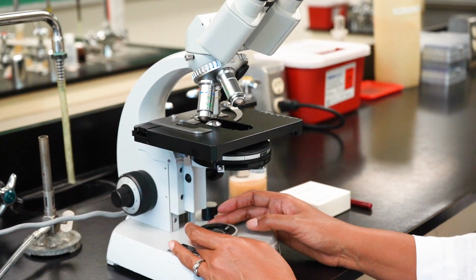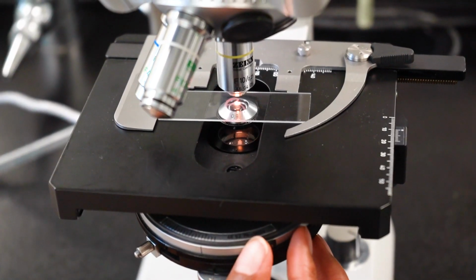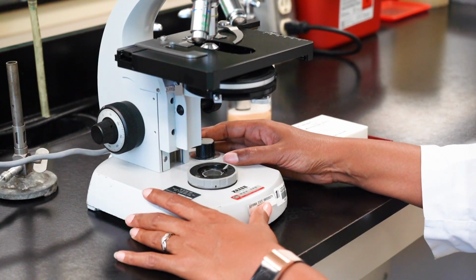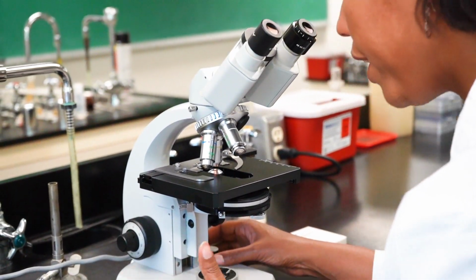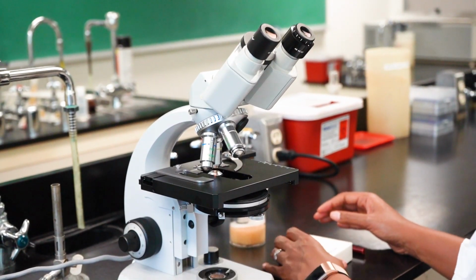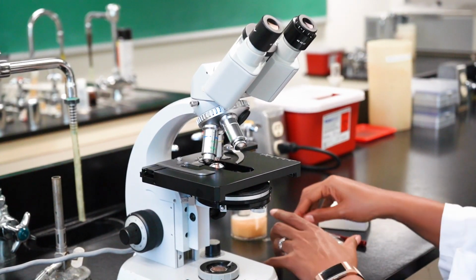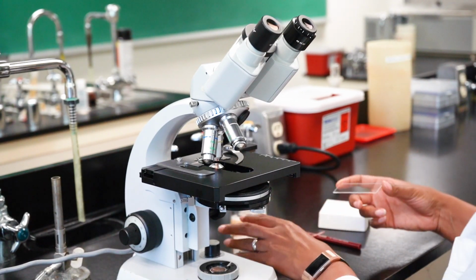And finally, you're going to want to open the lamp diaphragm and the iris diaphragm to its highest position so that maximum light enters your specimen. All right? You'll then adjust the illumination to a level that's comfortable for your eyes. Once the microscope is set up for use, we're going to do the Kohler illumination steps.